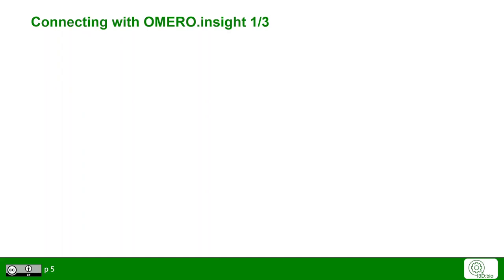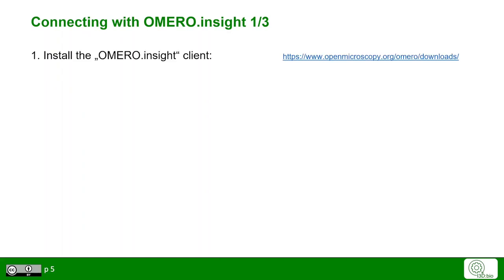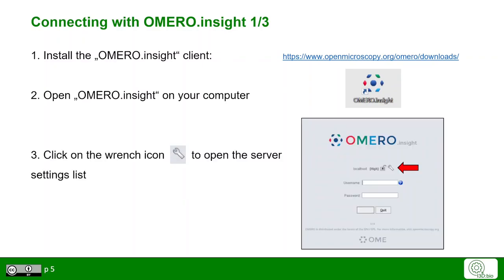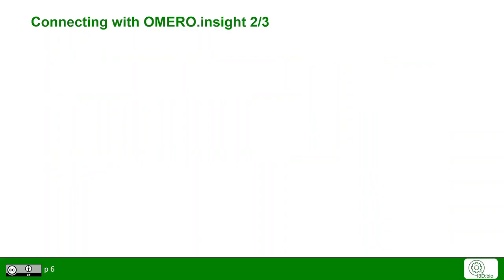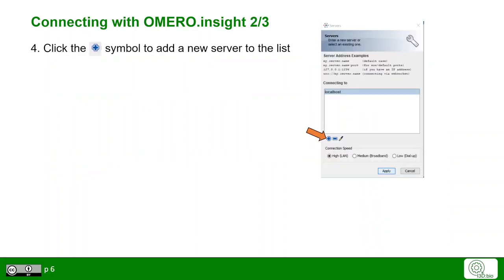To connect to OmeroInsight, you need to install the OmeroInsight client on your computer. Then open the Insight client window. First, click on the wrench icon to open the server settings. In the server settings, you will need to add a new server, since the local host server is not the right path. Click on the plus.